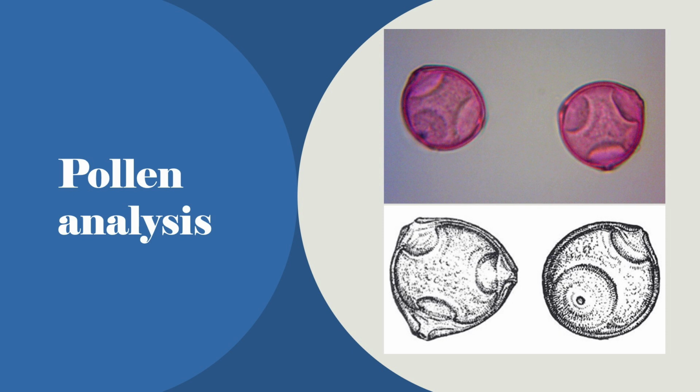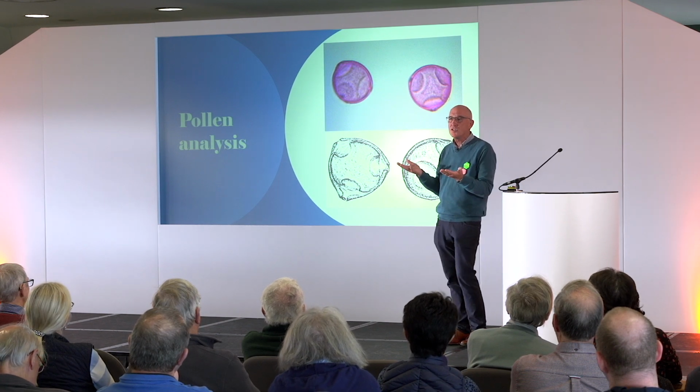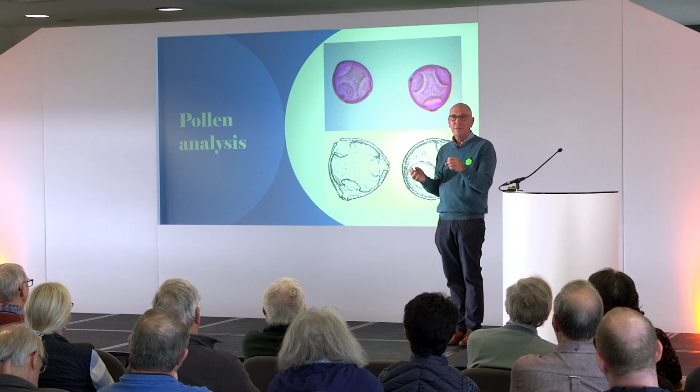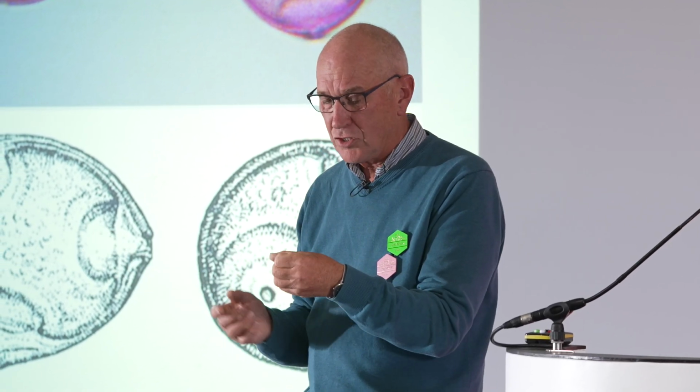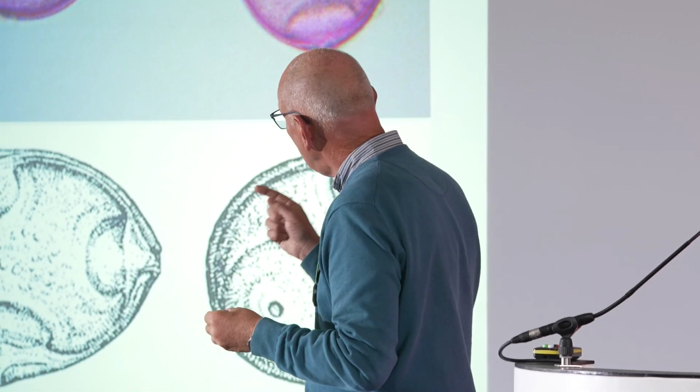Really, what most beekeepers are interested in is pollen. So here's a drawing. It shows you these little holes here, shows you the skin. What you do is you take your pollen. This is hazel. This hazel is normally 25 microns in size, and it can be used as a measure. I have put it into the National Honey Show slides. I've mixed in some hazel so that you can scale the pollen which you're looking at.